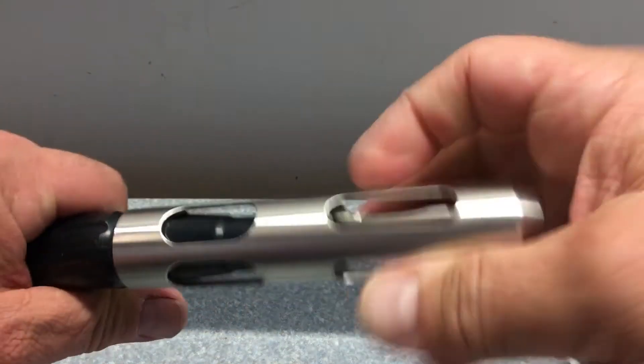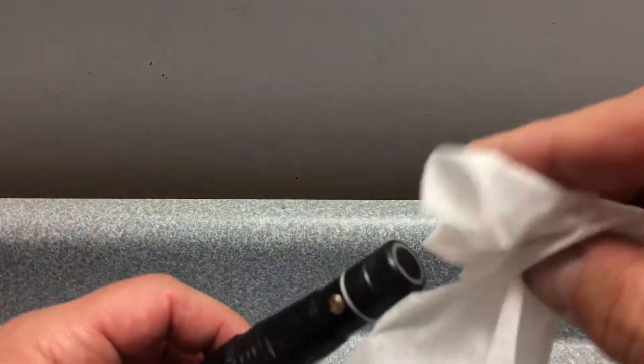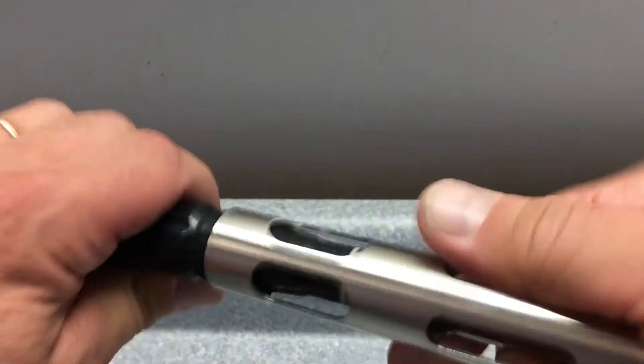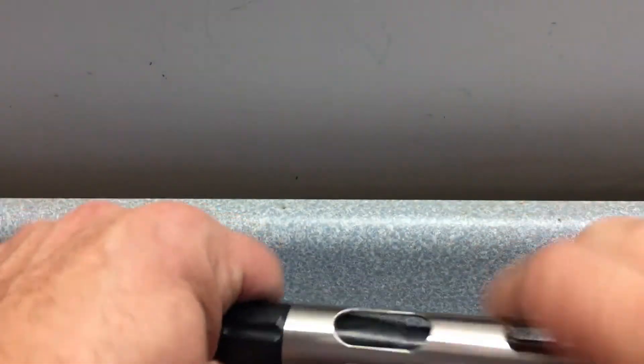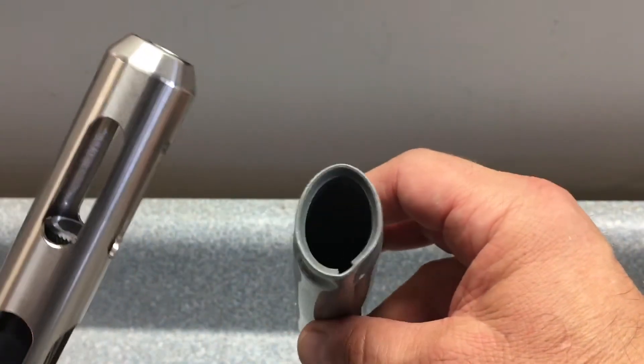As far as prepping the probe, right before you calibrate, dab it with a Kim Wipe. Make sure it's dry. Put your probe guard back on and always make sure that the calibration sponge inside is damp.